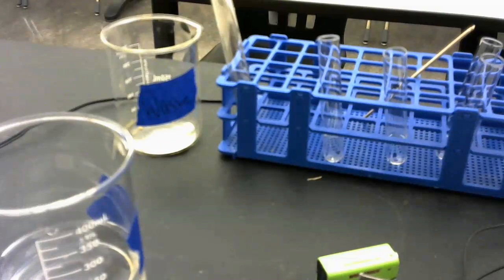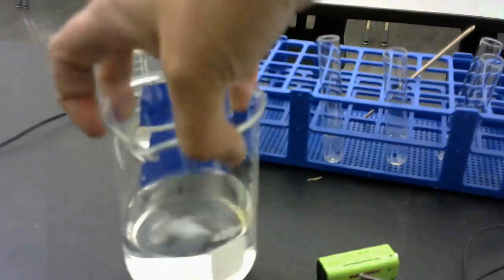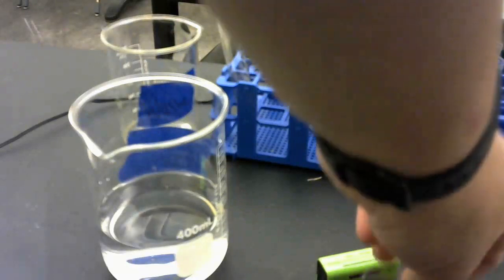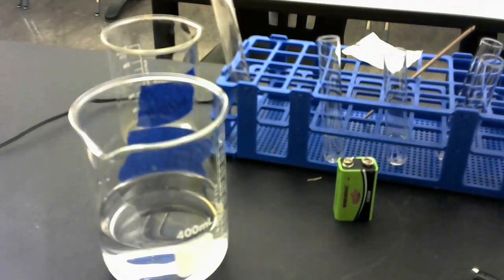So that's what I've done. I have created hydrogen and oxygen gas. Now, if you look at this beaker of water, you can't tell that there's hydrogen and oxygen gas because it's evaporated. But in this case, I have water, I'm running electricity through it, and I am producing hydrogen gas and oxygen gas. Okay, so hopefully that is what you saw there. And we're going to move on to our next activity.